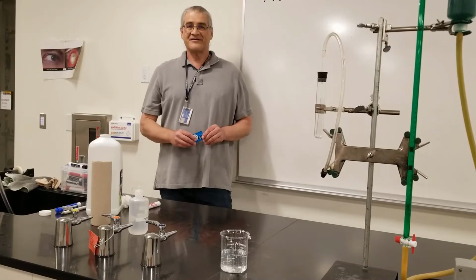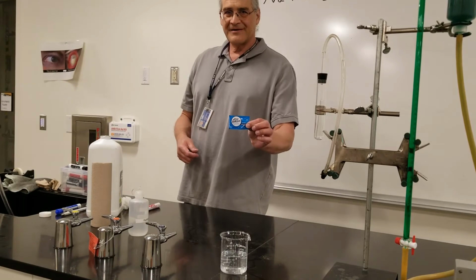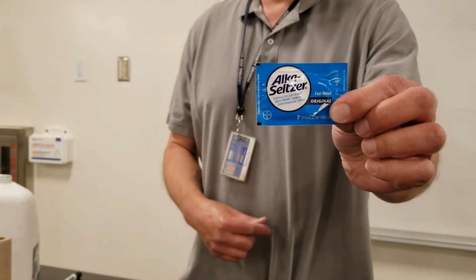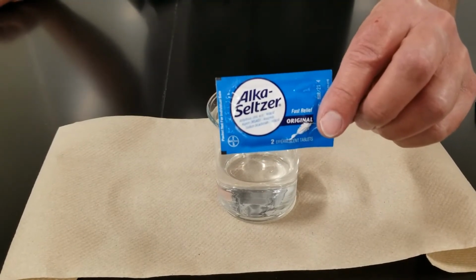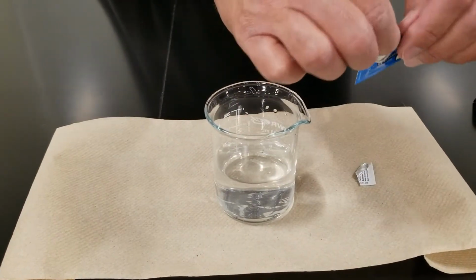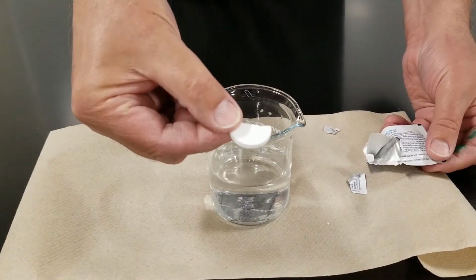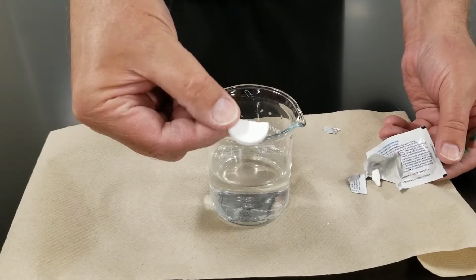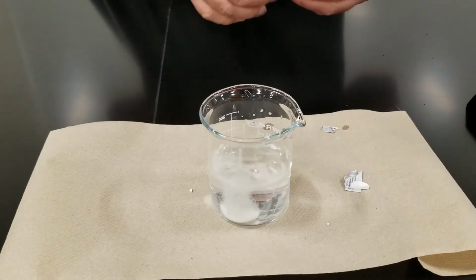Today's experiment is the analysis of Alka Seltzer. Alka Seltzer, if you're not familiar with it, is an old-fashioned hangover cure. The way it works, they're little dry tablets that contain aspirin, sodium bicarbonate, or baking soda, and a little citric acid. And you drop them into water.